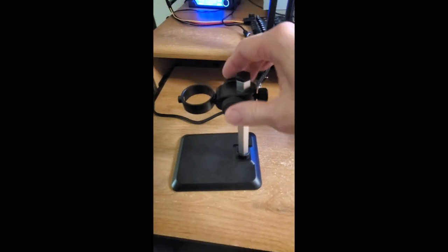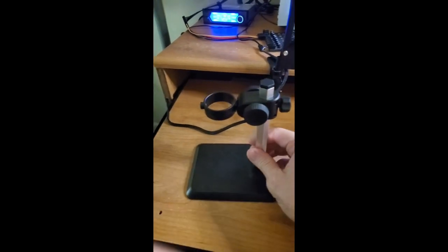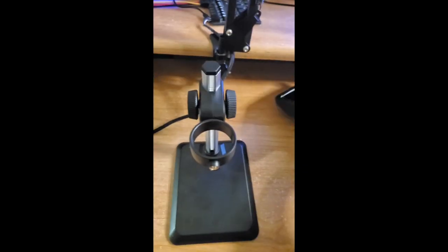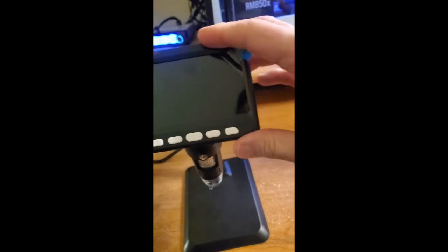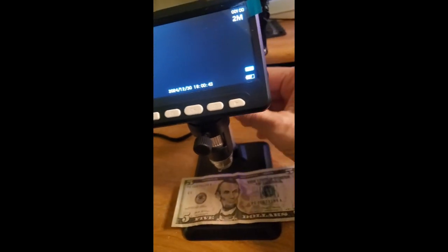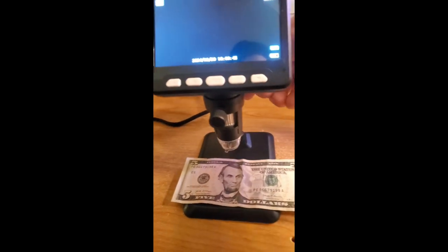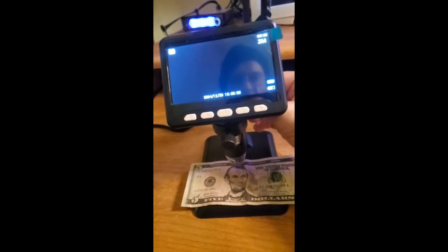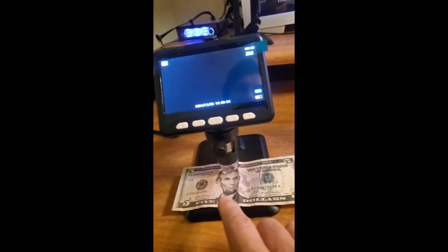So these are the parts of the stand. We have this piece here, and then the rod that holds it up, and then the base. And you can move it up and down. All right, so then you can take this and slide it in here. Then we just gotta lower it. So I'm gonna use this as an example. You have to lower it almost all the way down. Now you can actually get this really, really low, which is important because it doesn't focus much beyond that.